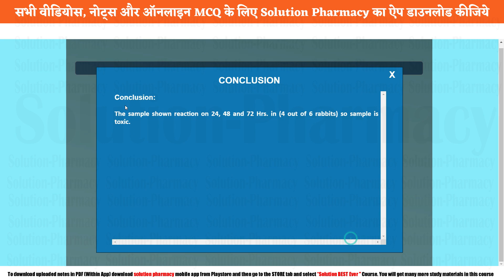The conclusion: the sample showed a reaction at 24, 48, and 72 hours in four out of six rabbits, so the sample is toxic. The given sample which we applied on the left eye of the rabbit is found to be toxic. And that was today's experiment. Thank you so much for watching this video. Namaskar, take care.